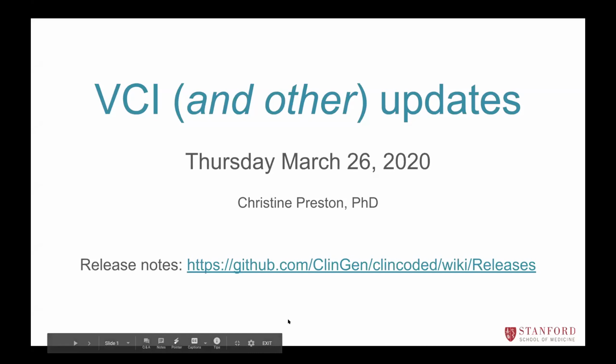So I'm Christine Preston, and I'm going to be giving an update on the recent releases that affect the VCI, and then also we have a number of features that we've developed and released that are kind of site-wide. So I'm going to be talking about those as well.